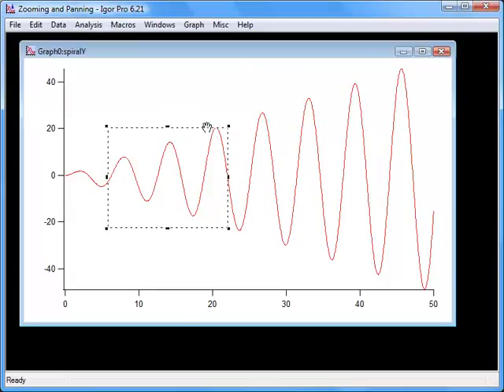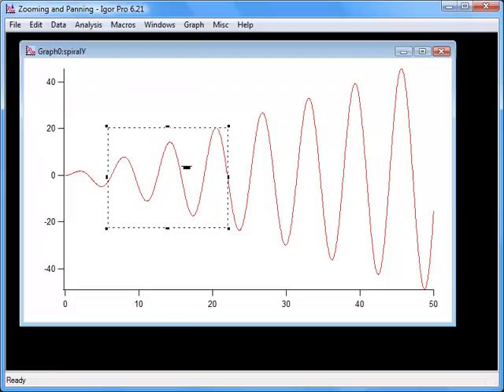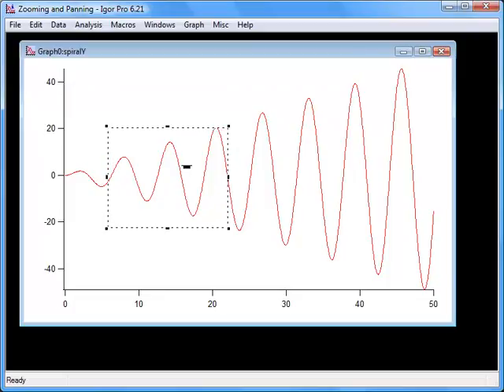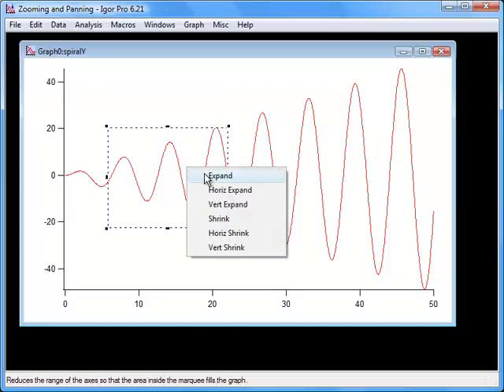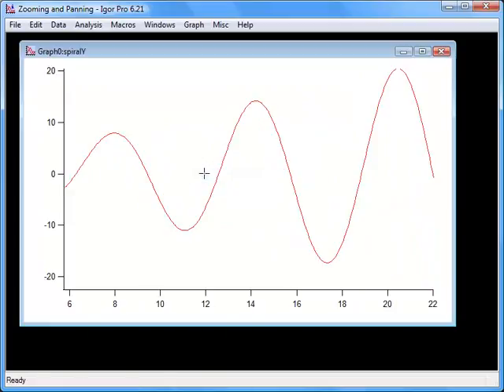Now, position the cursor inside the marquee. The mouse pointer will change to a new shape, indicating that a pop-up menu is available. Click and choose Expand from the pop-up menu. The axes will be rescaled so that the entire area is enclosed in the graph.